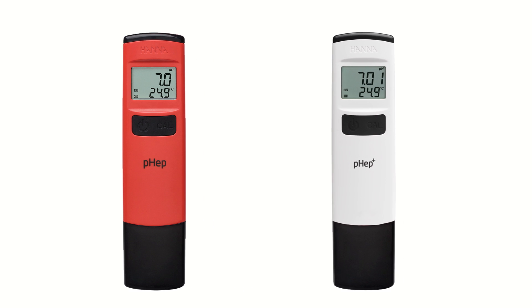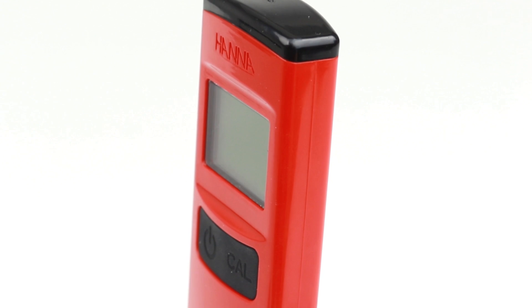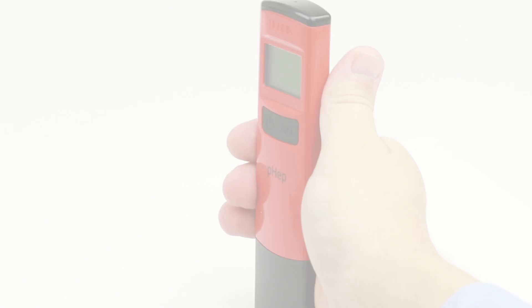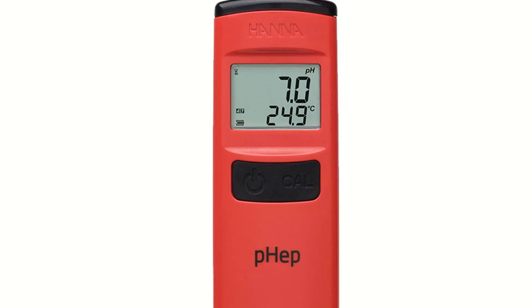They are the HI98107 and the HI98108. Both meters operate in the same fashion, with the only difference being the resolution. The Fepp meters are designed with accuracy and simplicity in mind, starting with a slim ergonomic design that fits comfortably in your hand and a high-contrast large display that is easy to read.